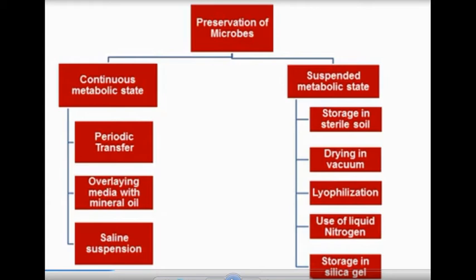Then the other type of methods, where we completely dry the organism, is storage in sterile soil, and this method is widely used for storing the spore form of the organism, mostly in case of fungal cultures.